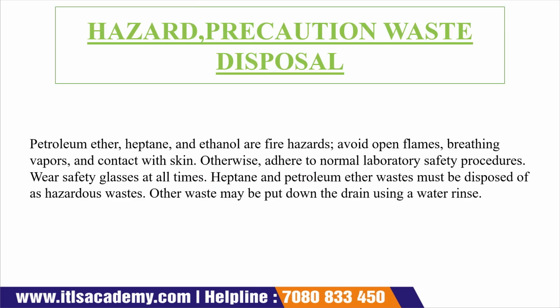Okay, now the next one is hazard precaution and waste disposal. We all know that we are using chemicals that are fire hazards, like petroleum ether, heptane, and ethanol. These three are fire hazards. So we avoid using these chemicals near a flame, we avoid breathing the vapor, and we also avoid contact of this type of chemical with the skin.